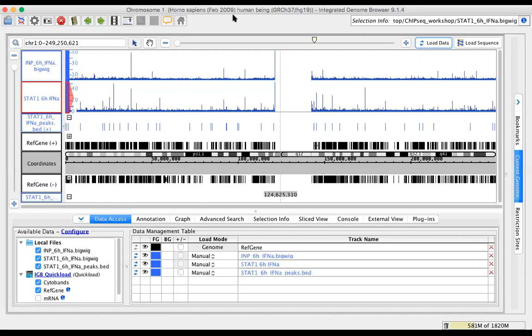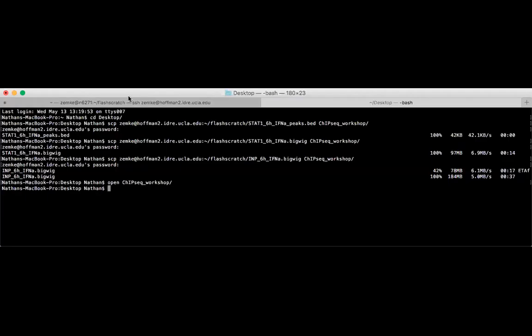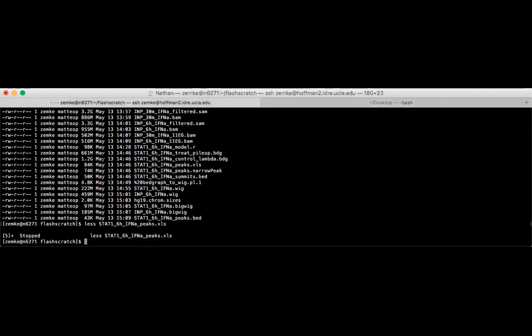So something that we still need to do, or at least I do anyway, is the other peak calling on the 30-minute interferon alpha treated sample. So what I'm going to do is go back to my command, which you can find just by scrolling up, or you can go to the slides. It was on slide, no, we're jumping around, sorry about that. Slide 52, the second command we still need to do, or at least I do.